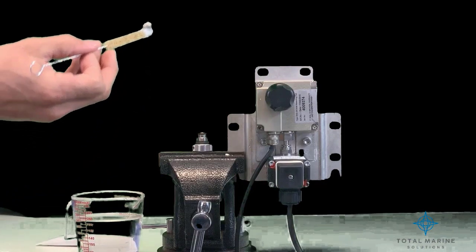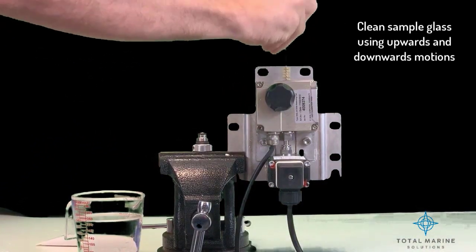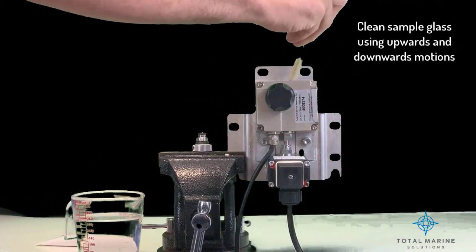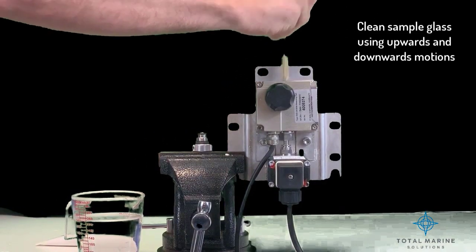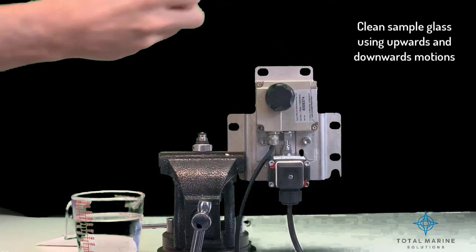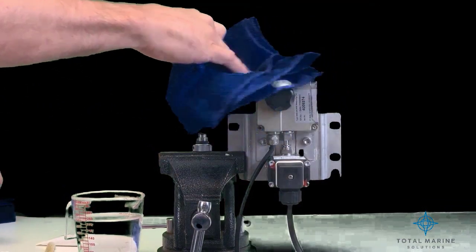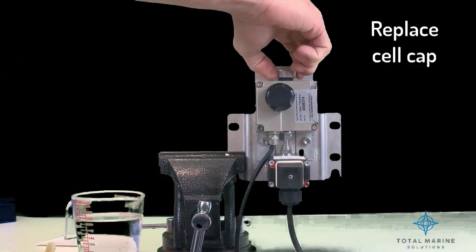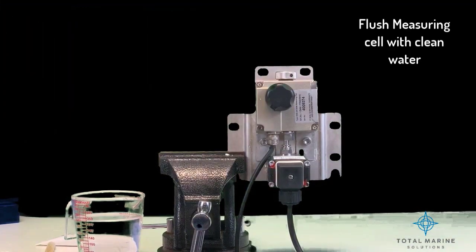Use the cell cleaning brush with upwards and downwards motion through the measuring cell several times. Remove the cell cleaning brush and replace the cell cap. Flush the measuring cell with clean water and observe that the display shows 0 to 2 ppm.